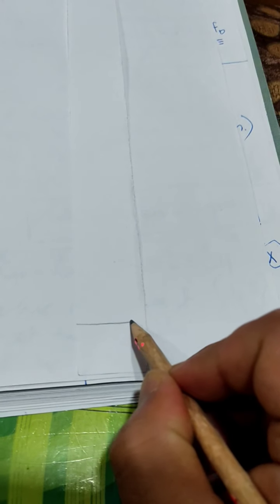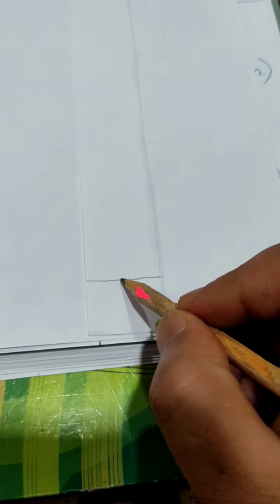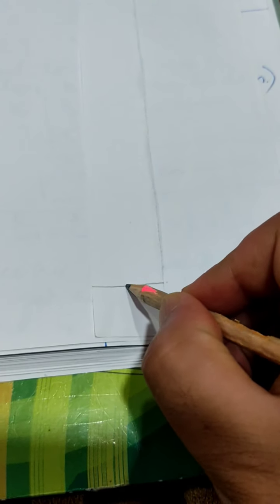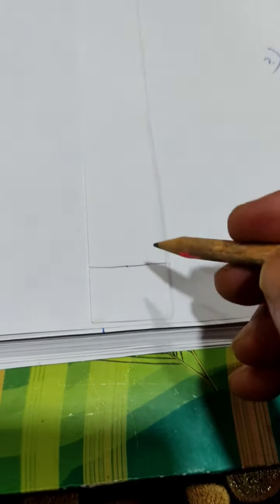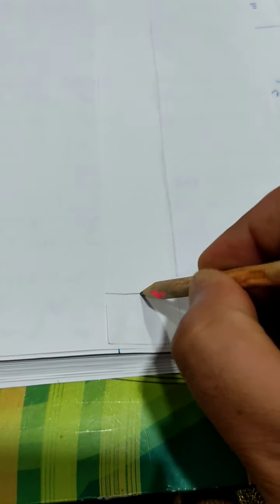You can see this is the Whatman's paper, and a line is drawn almost 2 centimeters from the base. This is called the base, and we choose the center of this line. At the center of this line, we simply put the spot.